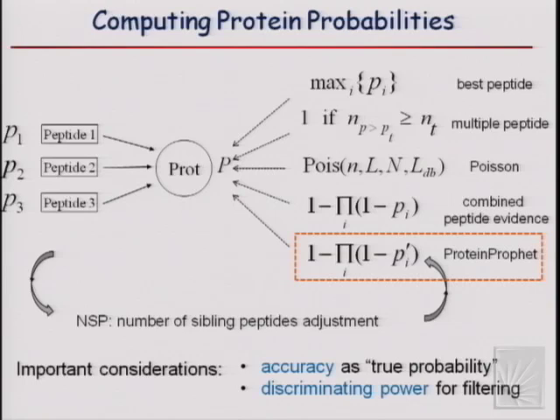You know, of course, they're not the same bait, but a lot of baits are interconnected. So oftentimes you're basically collecting more data on a small subset of the proteins than what would happen in a typical MudPIT experiment where you take a cell line, digest it, and analyze. And I'll come back to that and introduce a new concept of what I call over-sequencing.